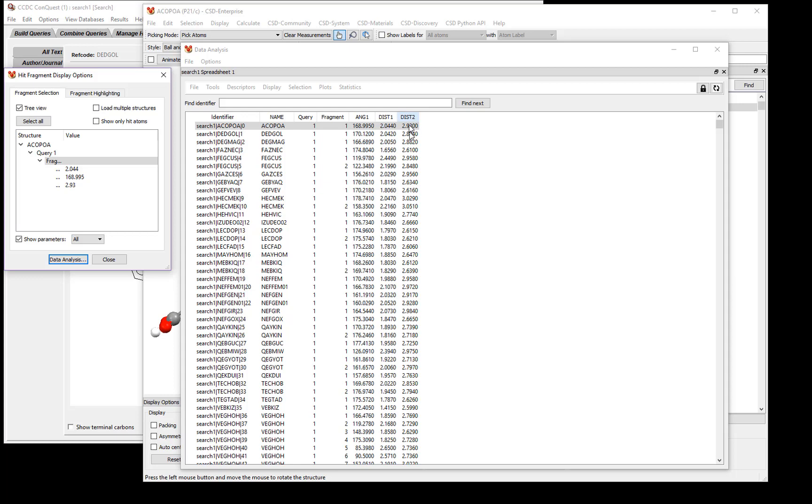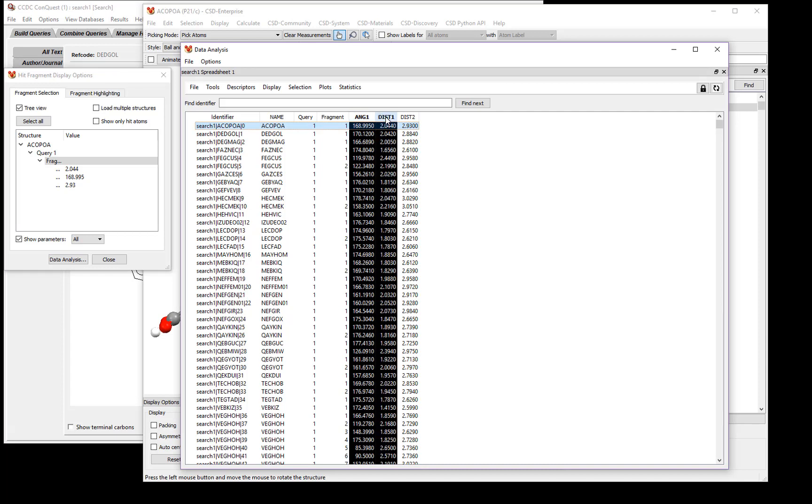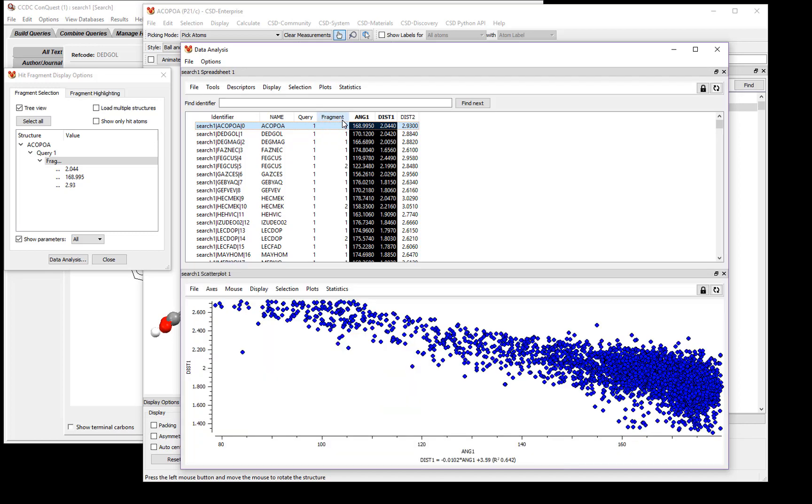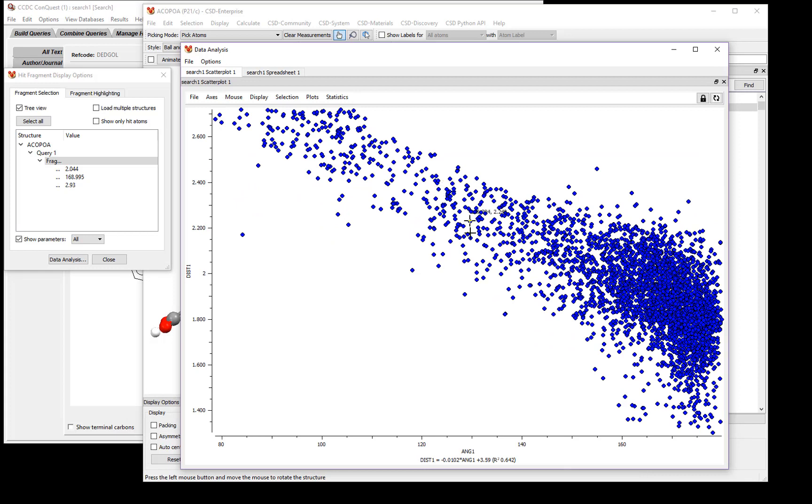Let's look at the variation between the angle and the distance. To do this, click to select the angle column and the distance column. Now click Plots, and then Scatter Plot. This creates a scatter plot of our data, showing the distance versus the angle.